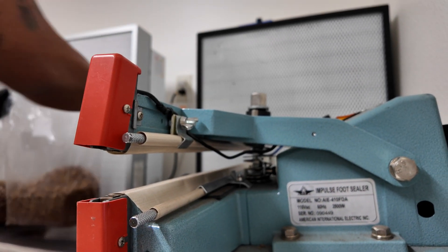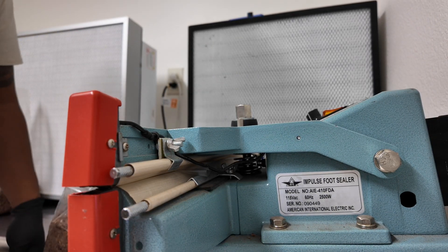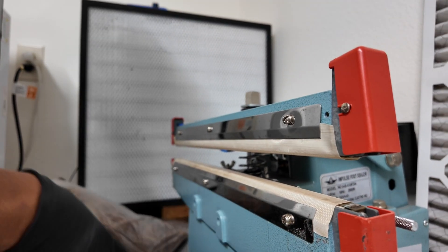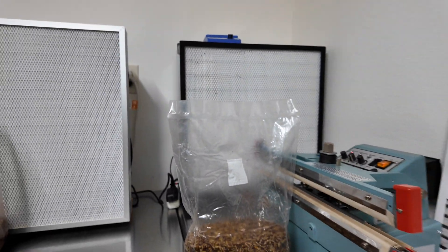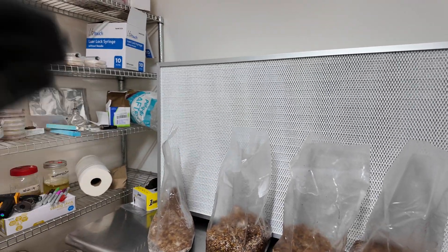We'll close it up and seal it using our automatic sealer. We'll also mix the bag to disperse all the colonized grain. And that is a generation 2 grain spawn bag. I'm going to do these four the same way, then do a second round of four — that will give me eight generation 2 king trumpet grain spawn bags from my one generation 1 grain spawn bag.